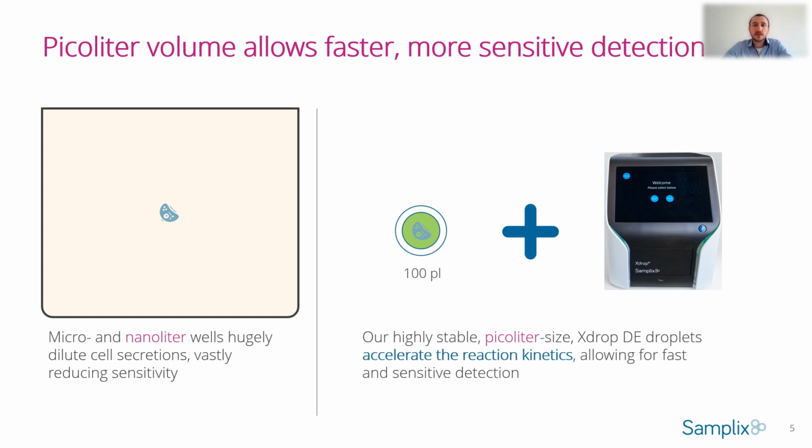One of the advantages with these double emulsion droplets is the very small picoliter volume you have inside. This means that secreted factors like cytokines build up fast inside the droplet. So you'll have sensitive detection of the secreted factors, and you'll also have fast readout compared to larger well-based formats.